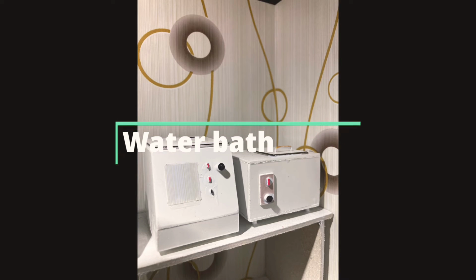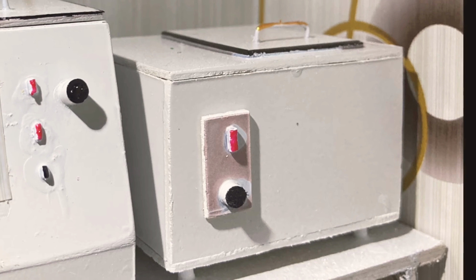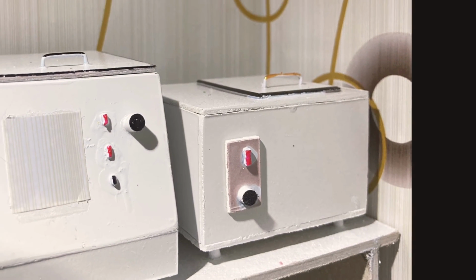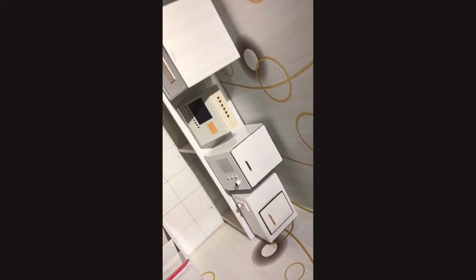Almost all laboratory personnel handle the water bath, which is another way to incubate at a constant temperature. This includes warming of reagents in the laboratory, incubation of cell cultures, and is a preferred heat source for heating flammable chemicals.